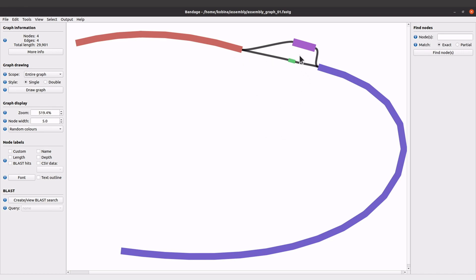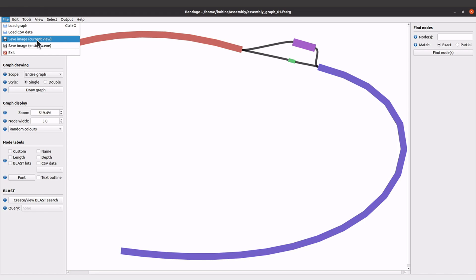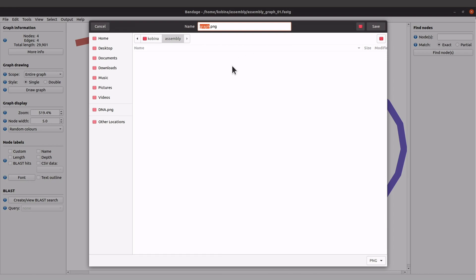Once you are okay with your graph and done, you can also export the graph as an image. You have to come to File and then come to Save Image Current View or Save Image Entire Scene — that is up to you. I'll use Save Image Current View, so click it. By default it will be saved where your assembly graph is located. You need to give it a name. The default file type is PNG, but you can come to this side and select a different one — we have JPEG and also SVG. If you want to do manual editing, I suggest you save it as SVG and then use tools like Inkscape to edit and add other details.